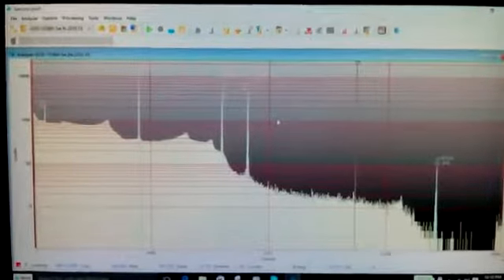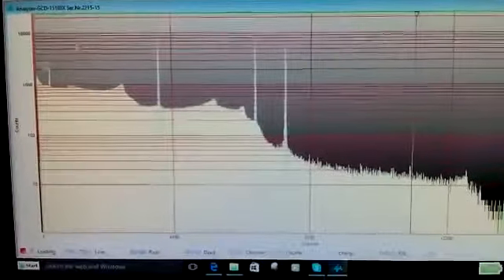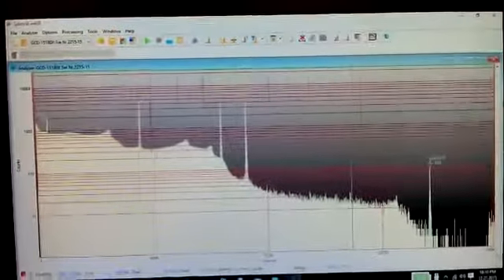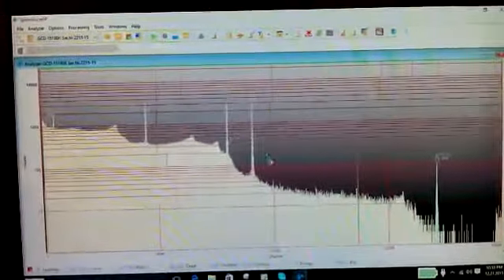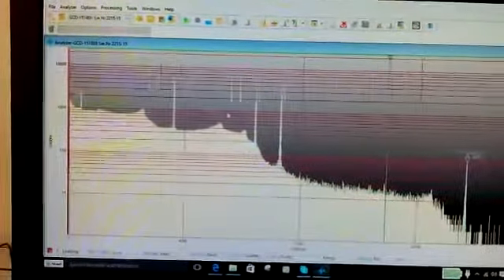In this part, we are going to follow up on what we do after peak search to conduct an energy calibration. In my previous step, I have already acquired a spectrum, loaded the default values for the energy and the shape calibration, and now I have conducted a peak search and identified some peaks of interest and drawn regions of interest around them.